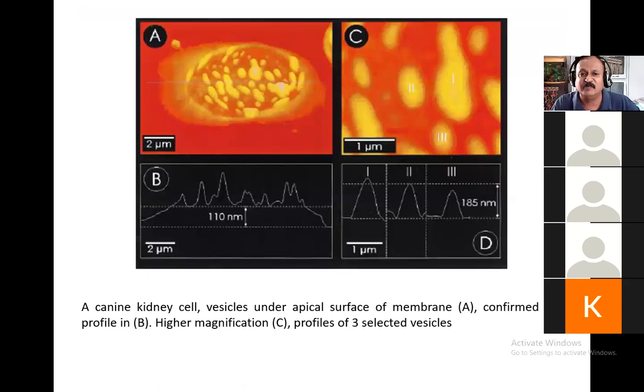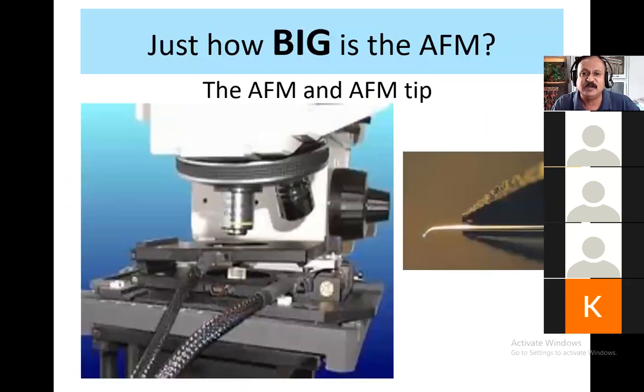One thing I have left out. This is very interesting. The atomic force microscope is placed under the objective of a normal microscope. It is placed on the sample stage of a microscope, and then you can look through the eyepiece. So you can observe through the eyepiece of the normal microscope where the probe is.